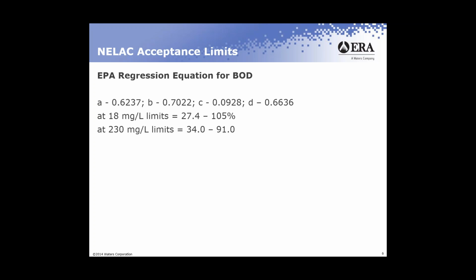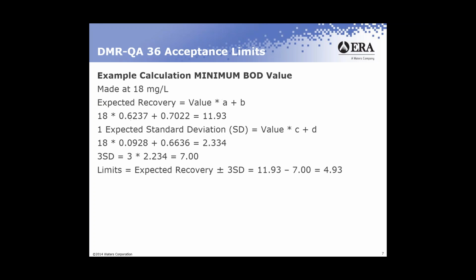So that values within that working range could be potentially acceptable values. Values outside that working range will absolutely fail your PT, so you won't want to report that. What that means is that there's something going wrong with your analysis. You want to take some time to troubleshoot, try to figure out what's going wrong, and correct that before you report your data.